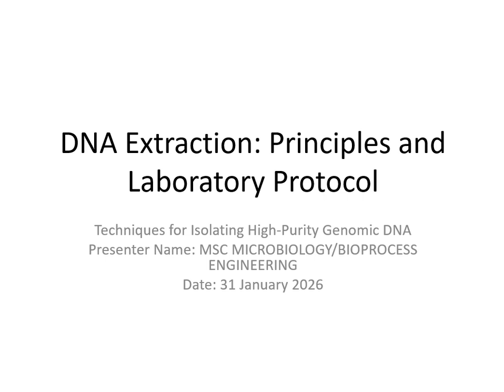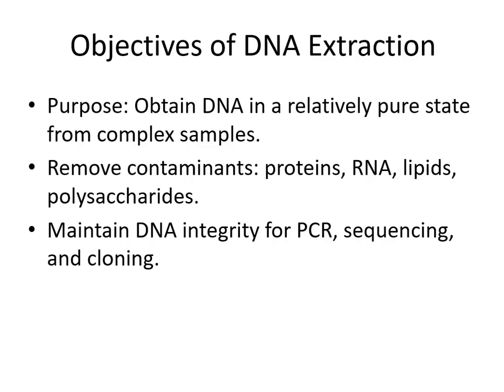Without delay, the objective of DNA extraction. The reason behind extracting DNA includes obtaining DNA in its pure state from a complex sample, either from plants, animals, or even a prokaryote and other eukaryotes. To extract DNA, initially we need to remove the contaminants present in the cell.